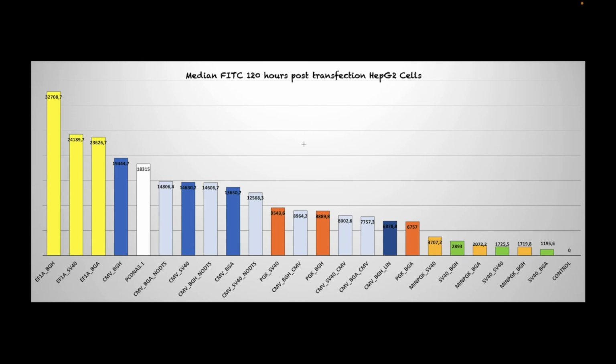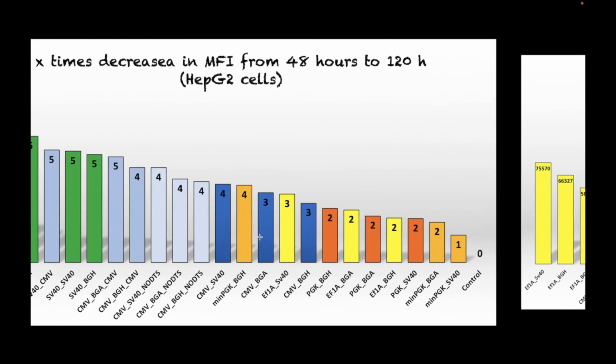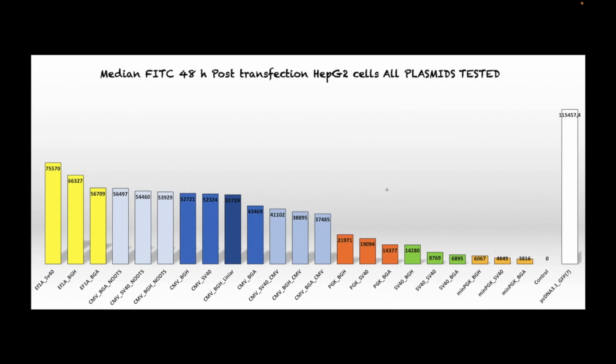And if you want to follow along, right now I'm going to switch to a different phase of my project. This was the optimizing phase, and right now I will try to get rid of the ampicillin resistance gene and the origin of replication in my vectors entirely, because study after study has shown that bacterial regions tend to get silenced when we're talking about mammalian cells.